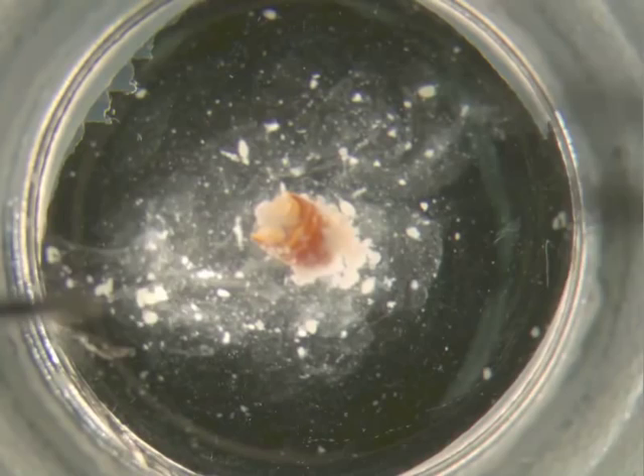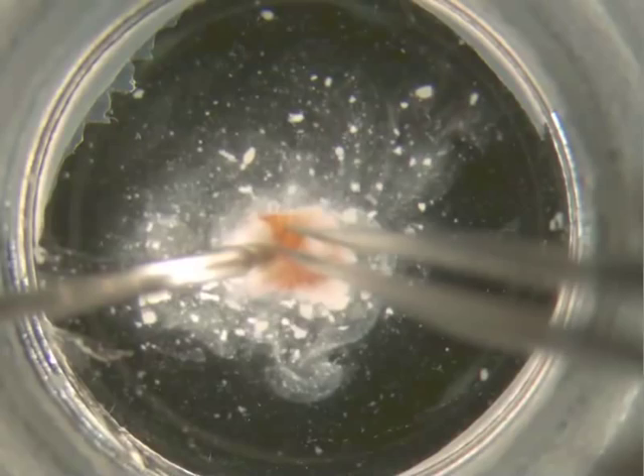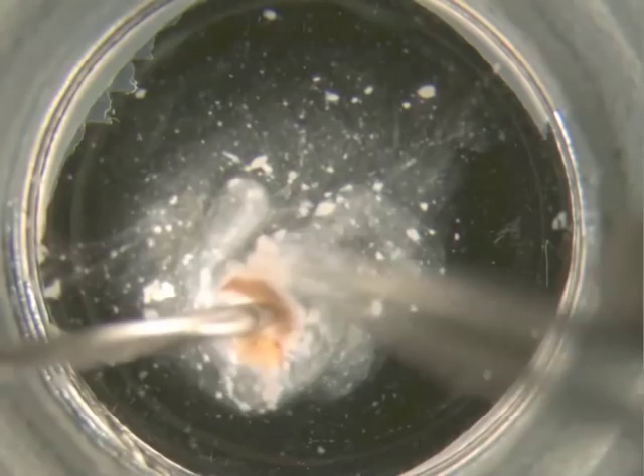Then you want to use the sharper forceps and a probe to break open the shell. It might be helpful to use the probe to hold the abdomen down and use the sharp forceps to break the shell open and allow the ovaries to come out into the PBS.